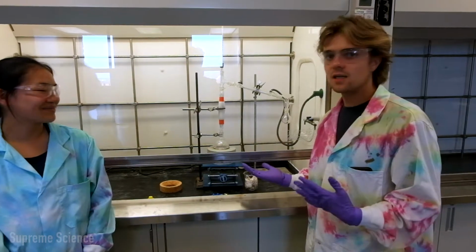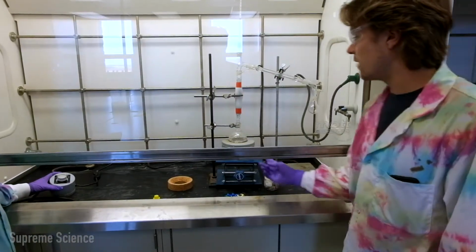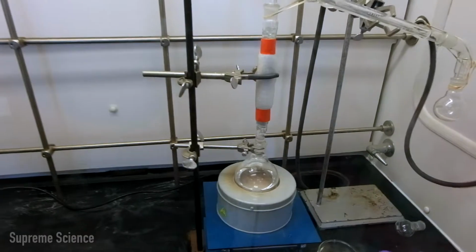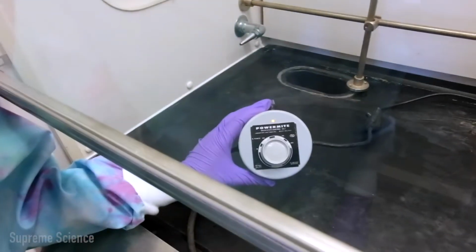So now that we have our setup how we want it, we can turn on the cold water. We have a boiling chip in our flask to prevent bubbling over, and we are ready to start heating. So the heat is on, and we're going to let that heat for a little bit.